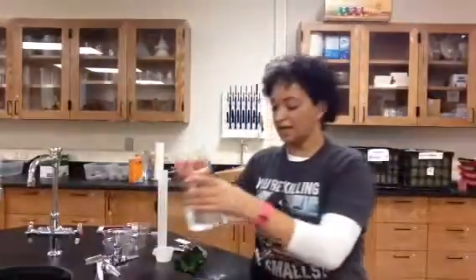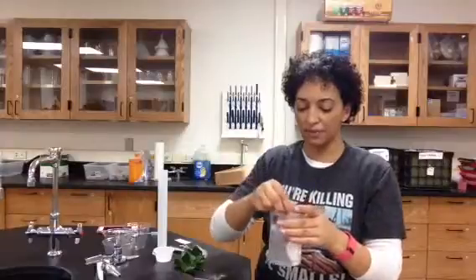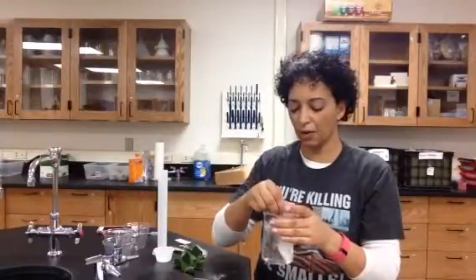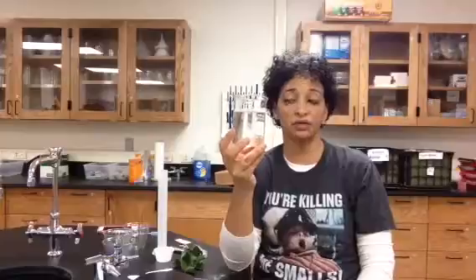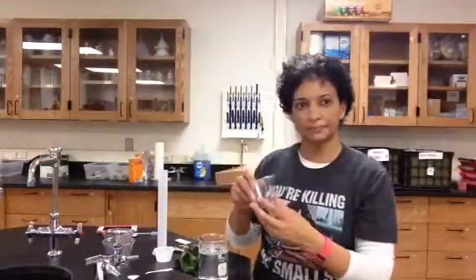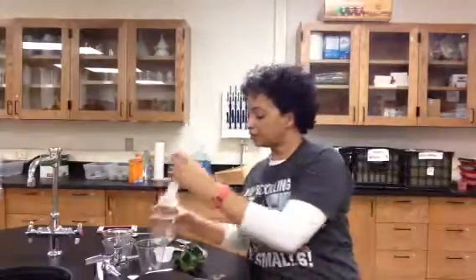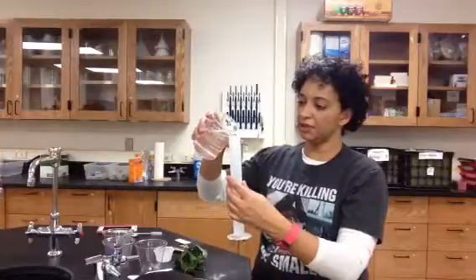So I'm going to stir all this together until I get all my baking soda dissolved and I got my soap in there. I shouldn't have too many suds. All right, so I have 300 milliliters of bicarbonate solution. That's what baking soda is. It's called bicarbonate. And I have 3 cups. So what I'm going to do is I'm going to measure out 100 milliliters for each of my 3 cups. So I'm going to pour 100 milliliters here into my graduated cylinder.